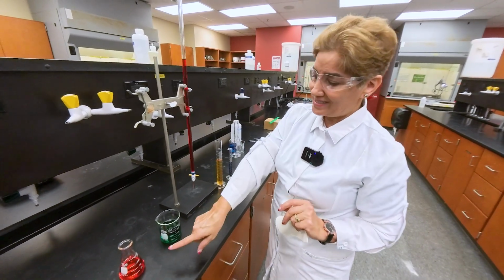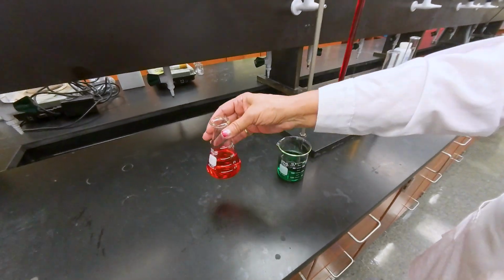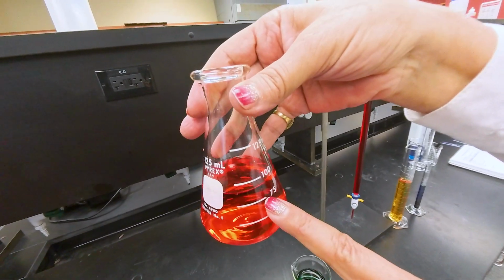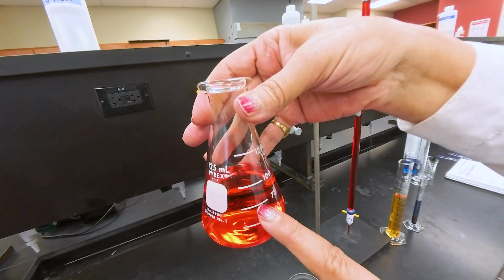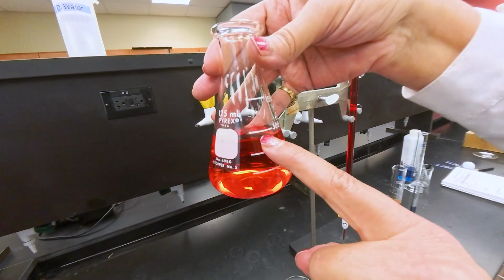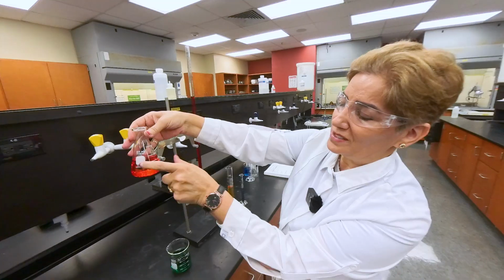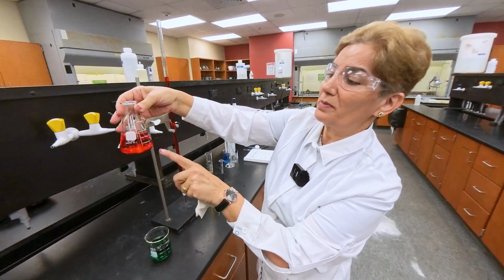The last station that we have here is the volume in a flask. Again, volume in a flask is not an accurate number, it's an approximate number. Between 75 and 100, you have like 25. You can mentally divide this space by 25 and see how many higher. But because of the shape of this flask, which is narrow the higher it goes, it's not as easy to estimate this number by mental math.